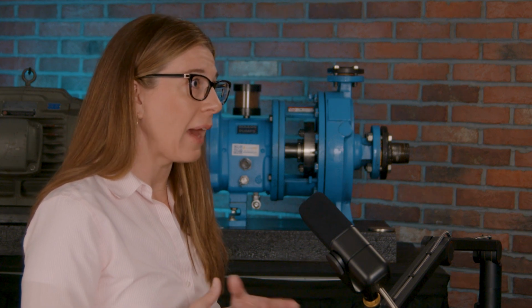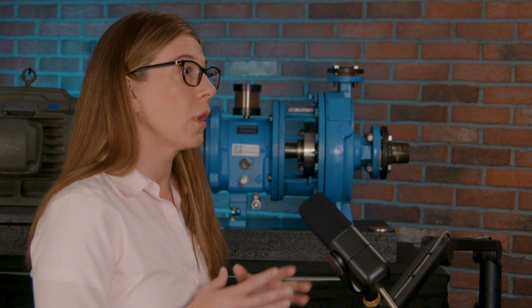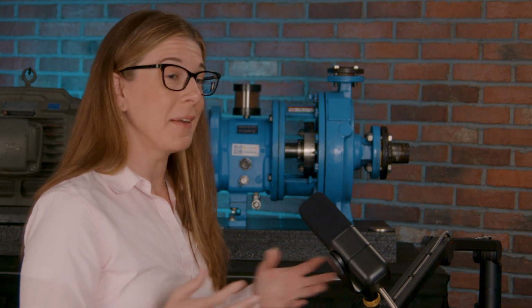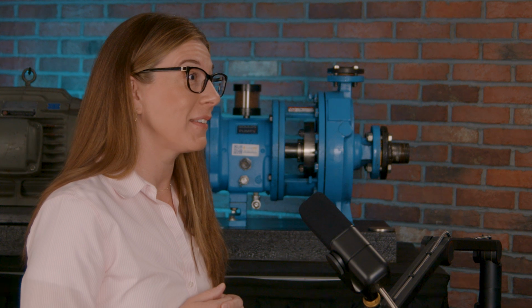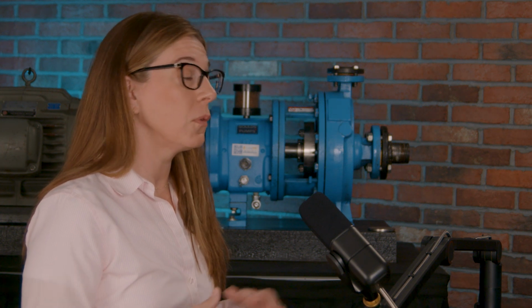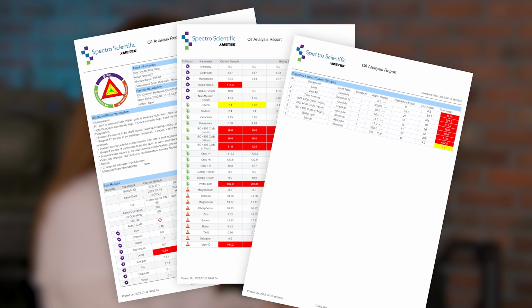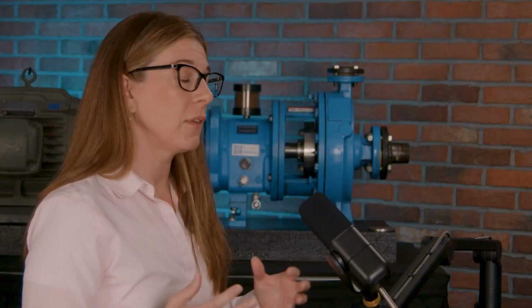Yeah, so ASTM has a standard that is specifically developed for looking at the statistics and helping to set alarms for in-service oil analysis data. I didn't even know that until I really started getting involved with ASTM quite heavily. And it's extremely helpful, being able to use historical data to understand what is the history of the oil data on our specific piece of equipment, and how can we use that data to help us set alarms.